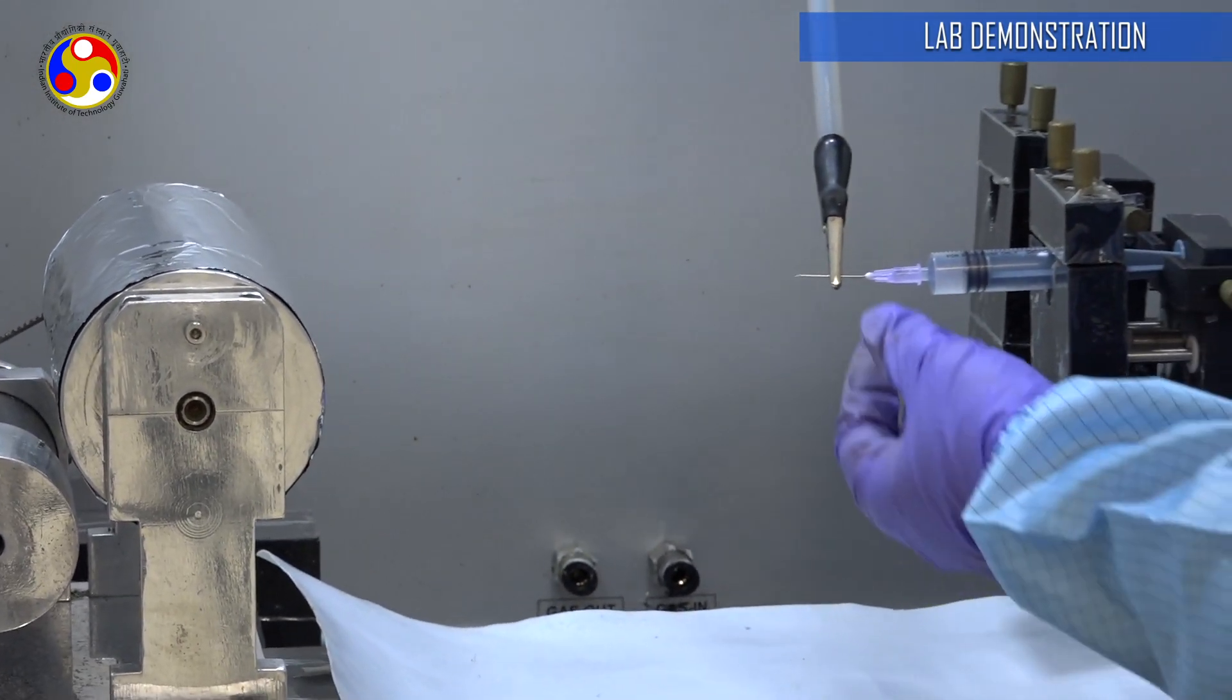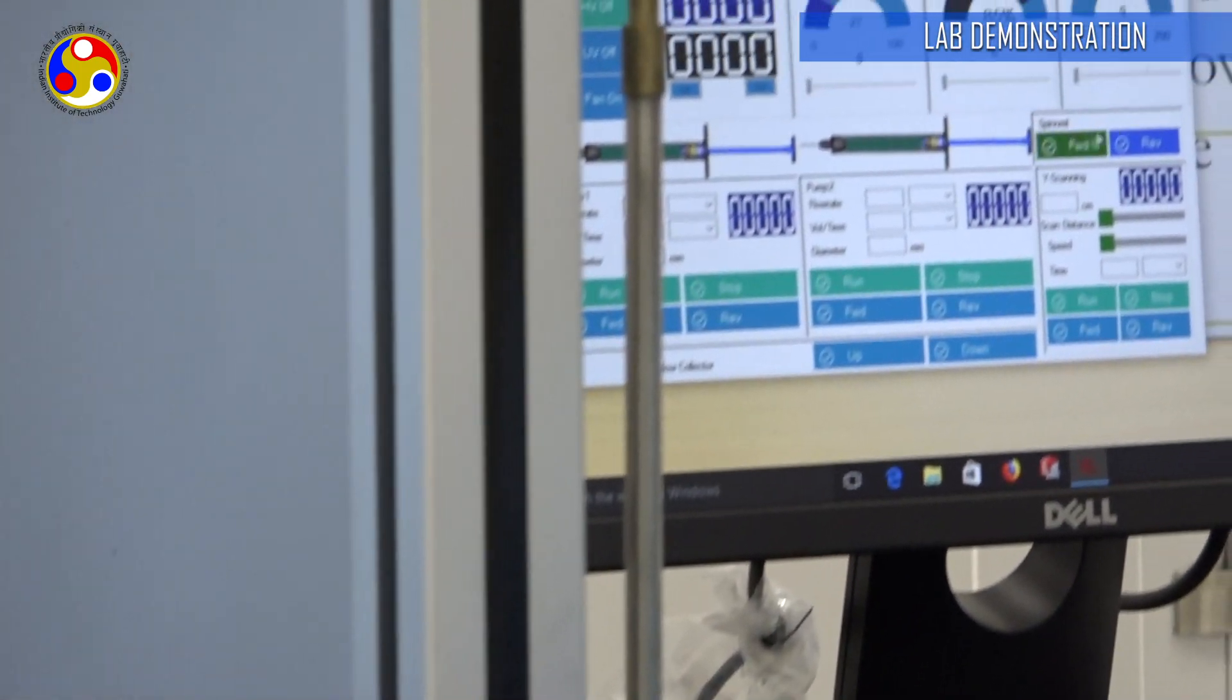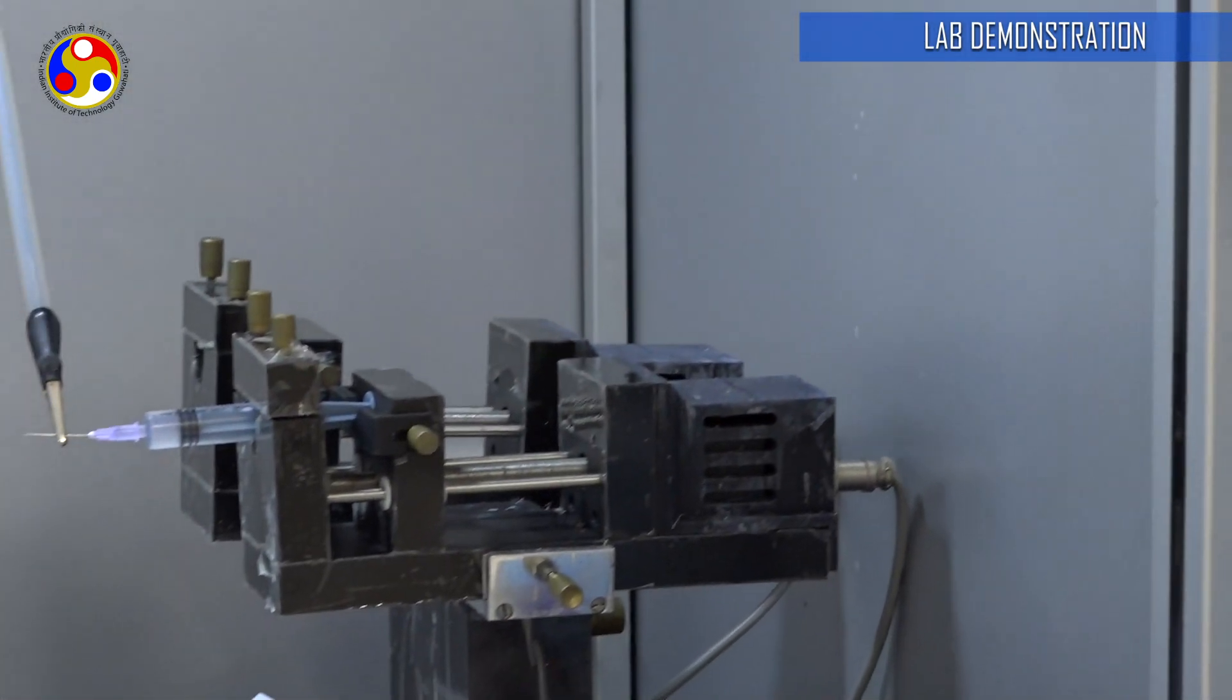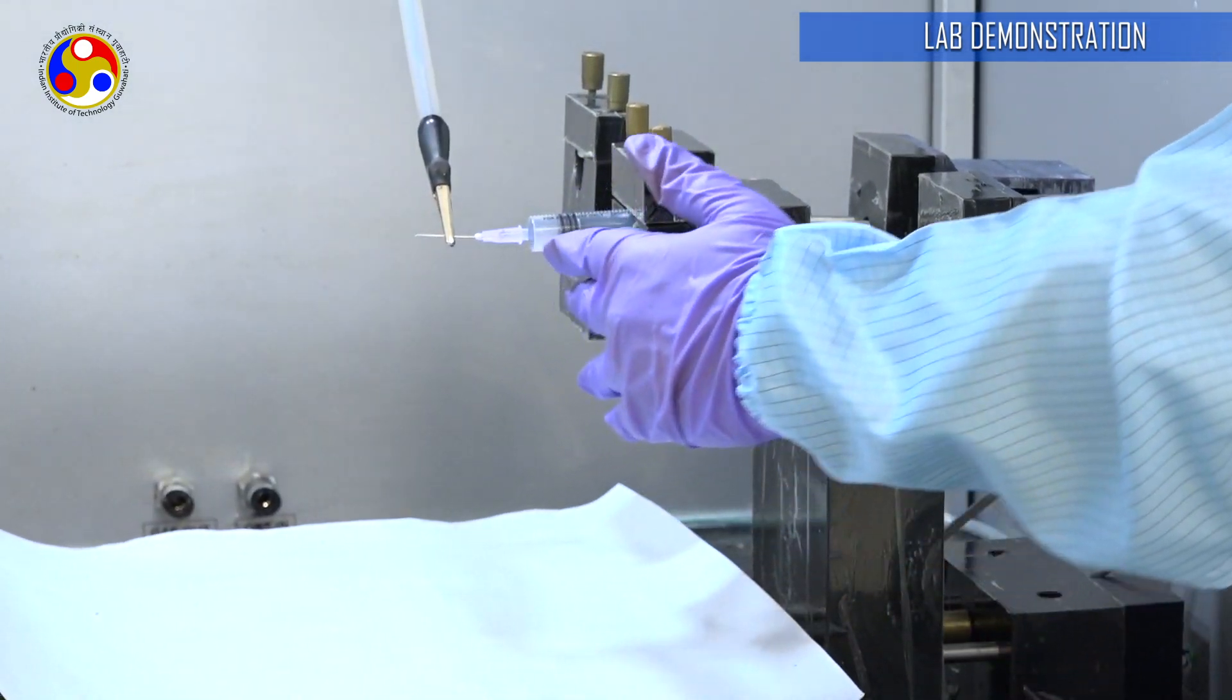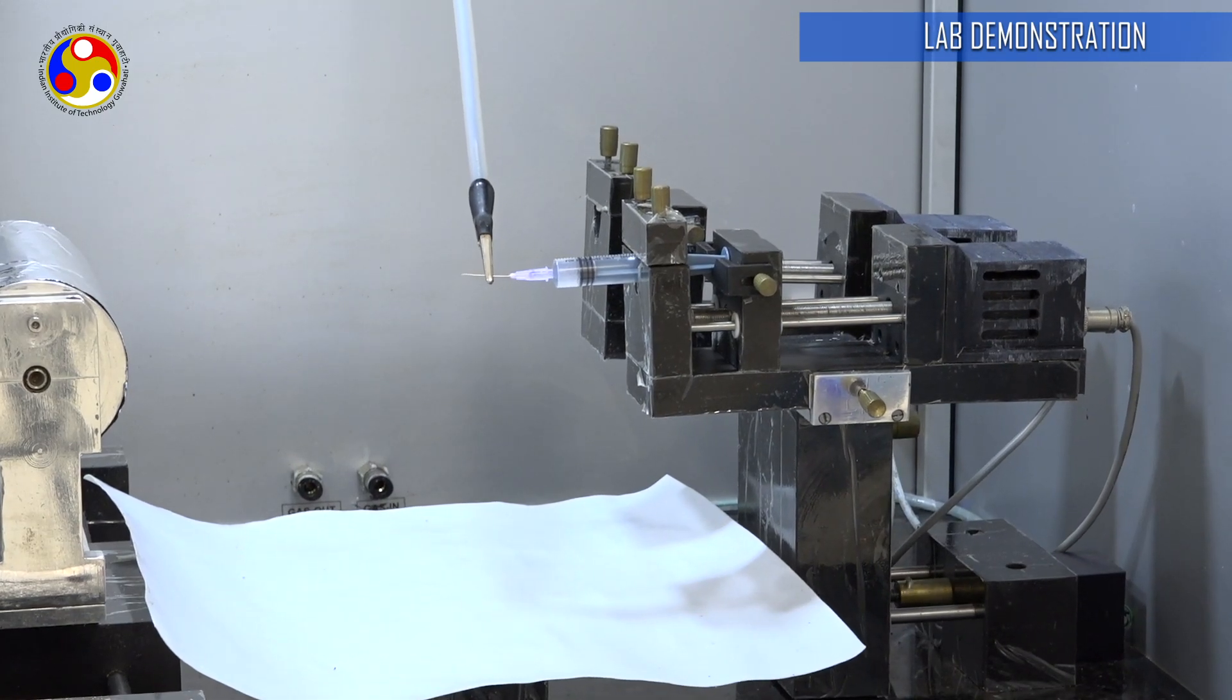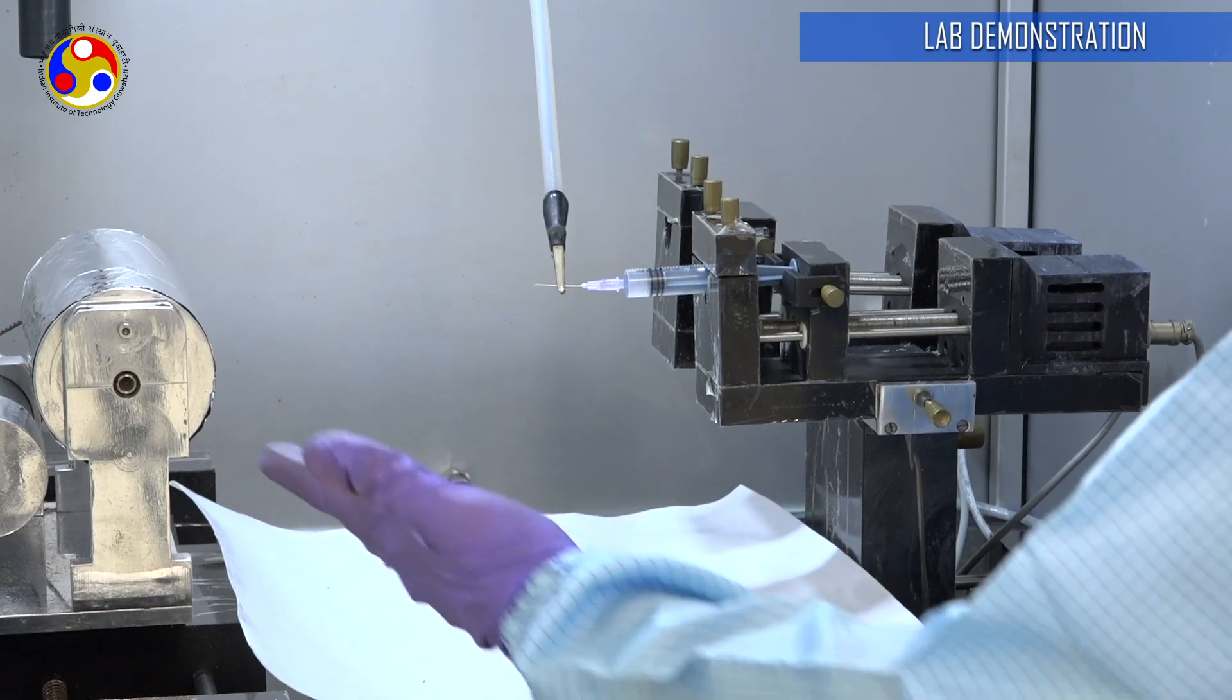Another important parameter is the distance between the syringe needle and the collector. This can be controlled with this. I am going to press reverse, so it will go backwards. This is about the maximum distance that we can keep between the collector and the syringe needle. If we want to decrease it, we just have to press forward and it will go forward again. The maximum distance between the syringe needle and the collector is approximately 15 centimeters, so of course it will depend on how much distance you want to keep.